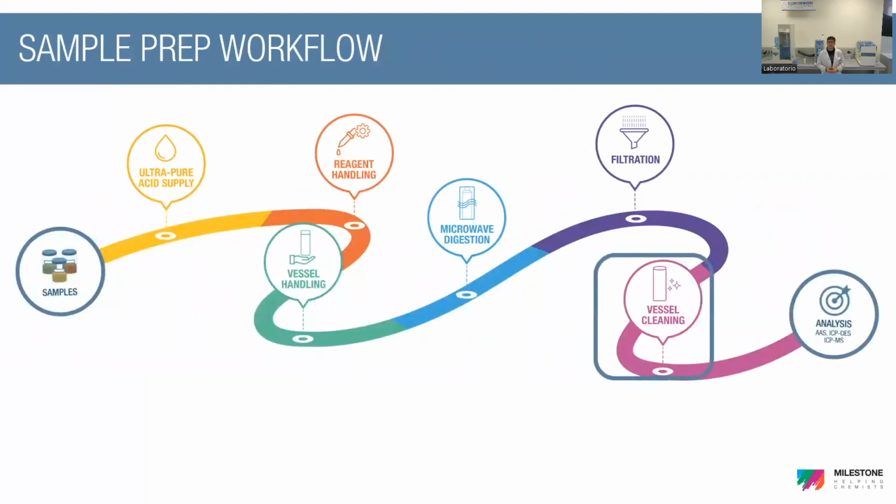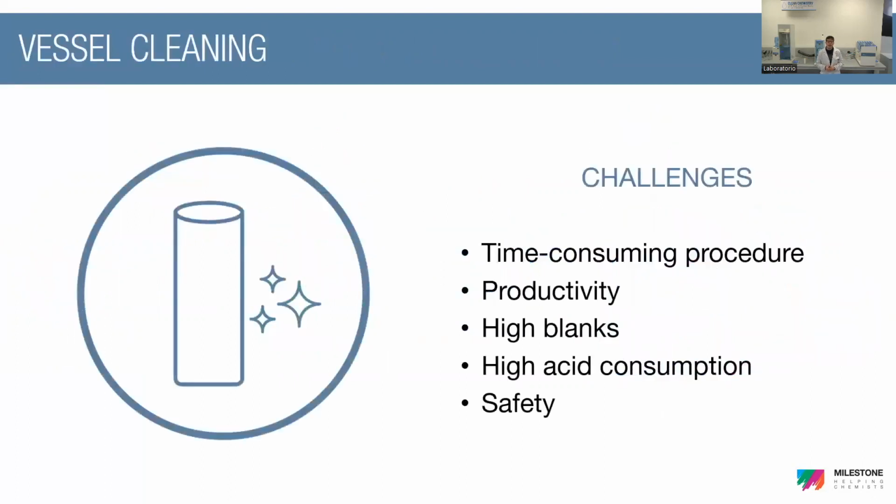That's why each single step involved in the sample preparation workflow should be considered, starting from the beginning until the end, so involving the overall process. Now, with this last section of today's e-workshop, we will focus on vessel cleaning. When we talk about cleaning, we have to say that this step is historically and traditionally affected by many challenges that you may face.